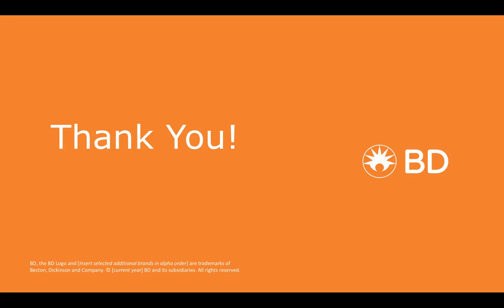And we've done some good updates on Phenograph, things like it will now automatically install the packages in R that it's dependent on. And it's also going to delete its own plugin node and pop open a little graph window when it's finished calculating, so you'll know that it's completed. Really good question there, Dan. Thanks for asking that. And I will, like I say, try to show that as we get into the live demo.